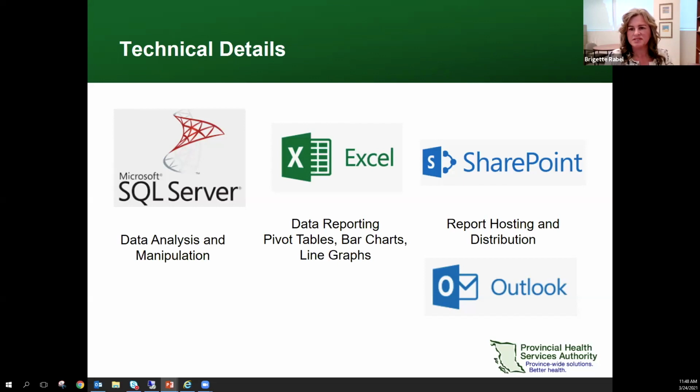So the pathologists access their dashboards on the SharePoint site. Surgeons, on the other hand, opted to receive the reports emailed to them as a PDF. Since Outlook interfaces easily with Excel, report distribution by email is simple. With a click of a button, a VBA macro kicks off in the background, and the PDF is automatically emailed directly to surgeons.